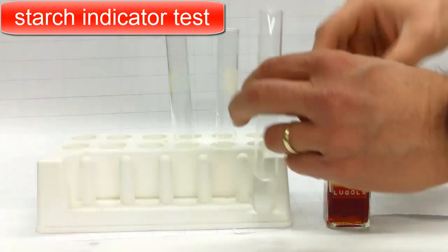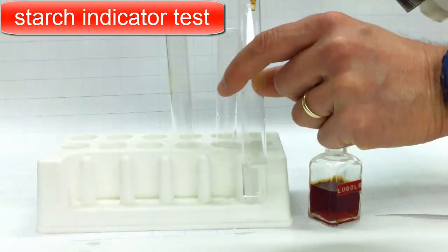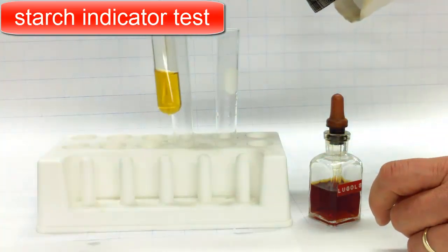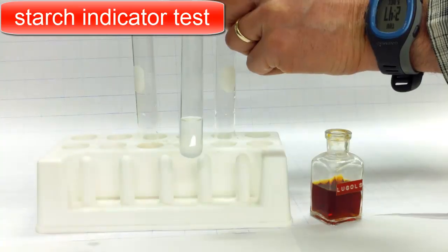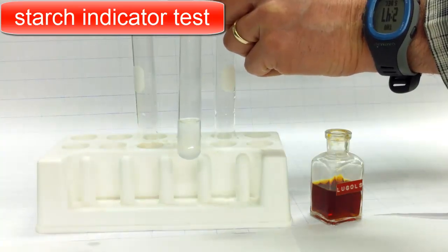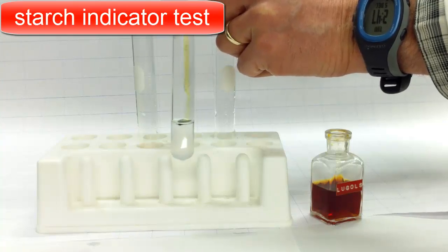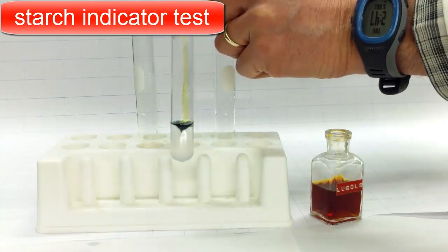So let's start with the distilled water. You place 10 drops into the distilled water and agitate it. This indicator does not have to be heated. Now let's do the starch indicator in the starch solution. You'll see there's an immediate reaction with only 1 or 2 drops.